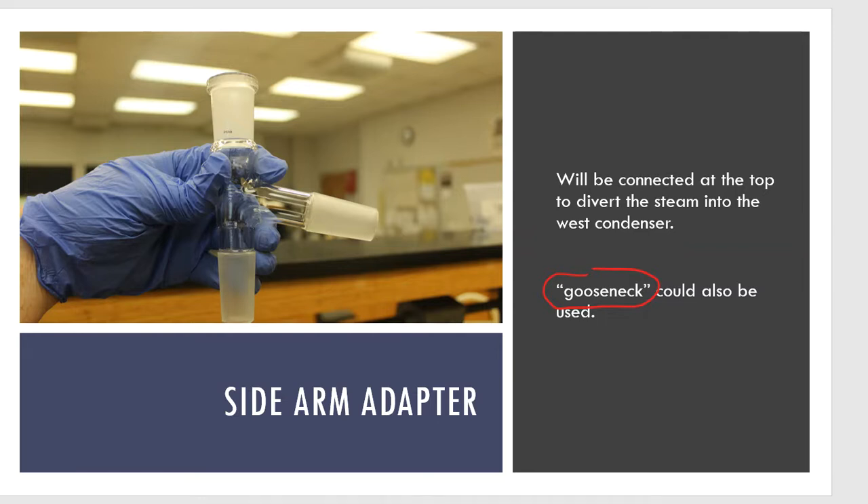Up at the top I'm going to put a sidearm adapter, though I could have also chosen a gooseneck adapter. A gooseneck adapter looks just like this except it completely curves with no joint at the top — that would for sure prevent loss, forcing everything to go over through the west condenser and drip into your collection flask. Either one of these would be okay.